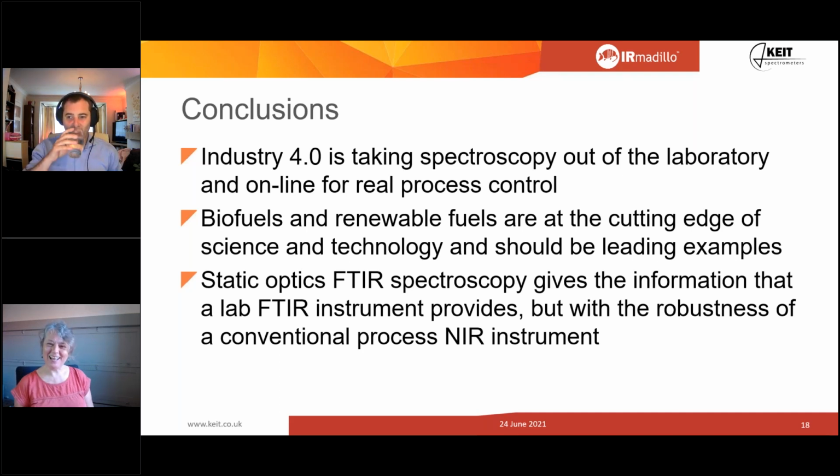I will answer a question myself while they're typing. I was very interested in your comment about the fact that you can see transitory species, things that you would not be able to see in offline analysis. And it seems to me that, particularly in such a complex situation as we have in biodiesel or renewable diesel production, I was wondering if you have any examples where you've found some new chemistry or people had some new insights in the way that their reactions work because they were able to see these more transitory materials that would have disappeared by the time they got it out into the lab analysis.